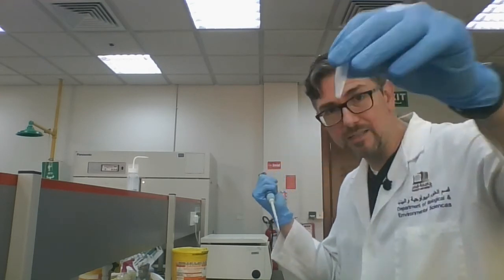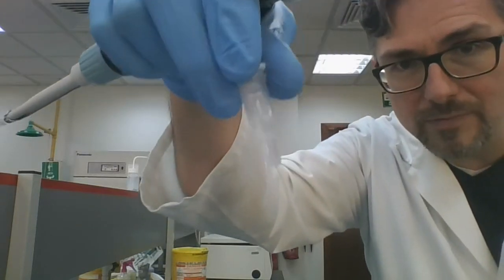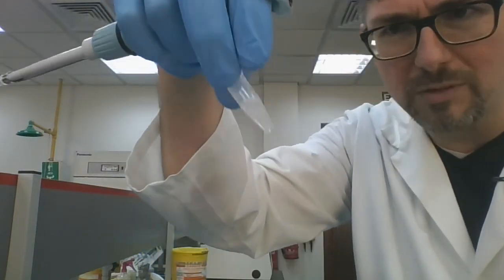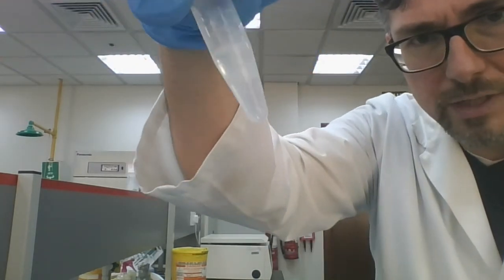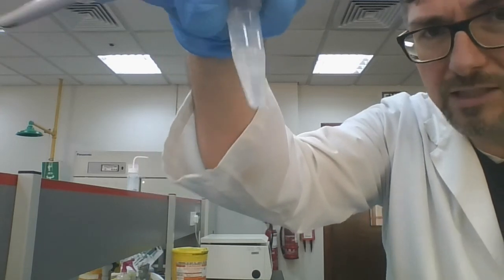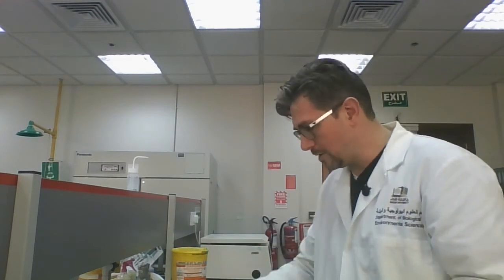And so I added the solution C. And one of the things you'll notice immediately is that there's going to be a white precipitate showing up. I'm not sure how well you can see that, but there is white stuff showing up inside this tube right now. Okay, that's the genomic DNA. So we will be getting rid of that, along with proteins and the membranes. Okay, so I'm going to put this back in.